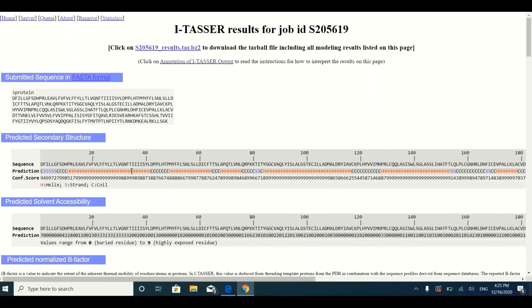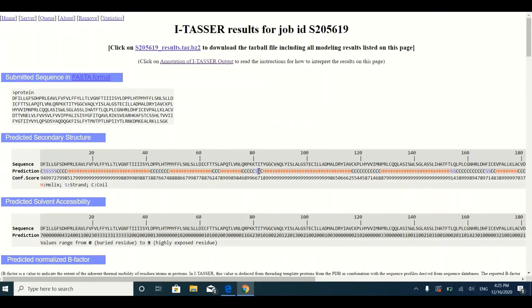Here, 'H' indicates a helix, 'C' indicates a coil, and 'S' indicates a beta strand. Below the protein sequence you can see these letters — wherever there is an H, that region will form a helix; wherever there is a C, that part will form coils; and wherever there is an S, it will form sheets. Below these alphabets you can find confidence scores for the secondary structure prediction.